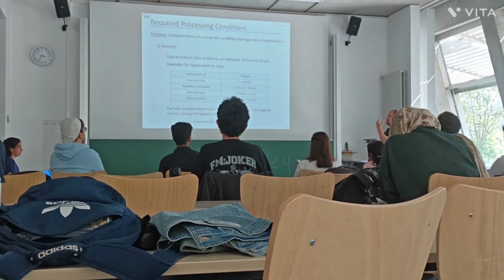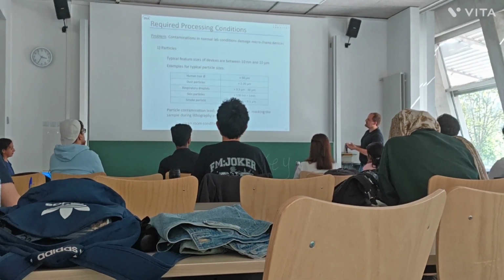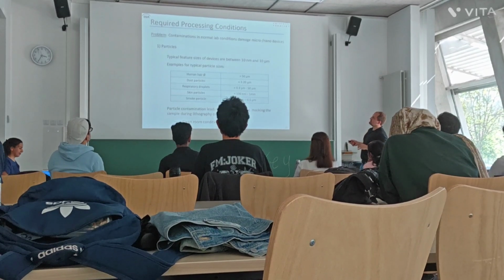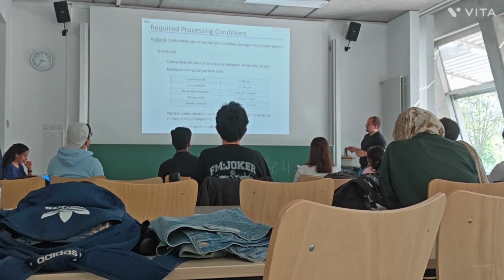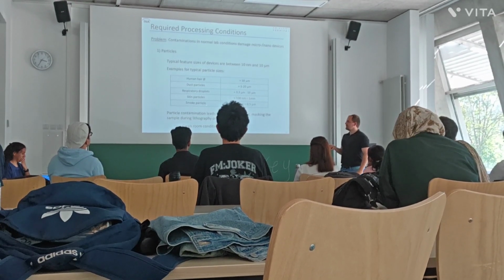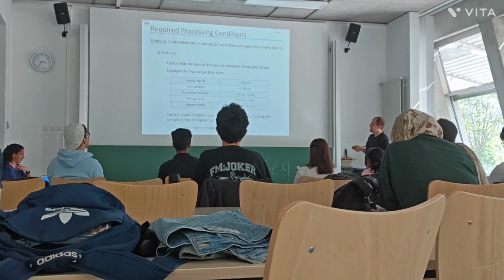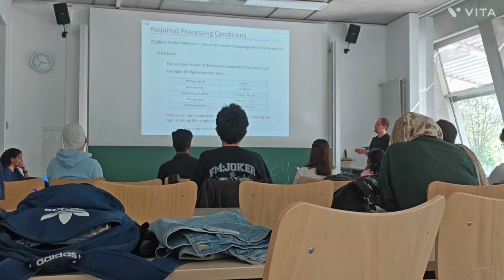Then, if I speak, for instance, if I exhale, I have respiratory droplets, which are also in the micrometer range. Skin particles are usually a little bit bigger. And then, especially for smokers, but I would say in our generation it's a little bit lower. If you smoke, then you exhale a lot of particles.